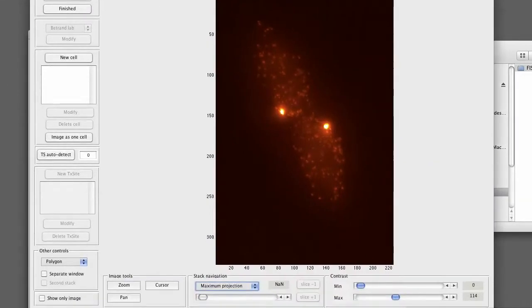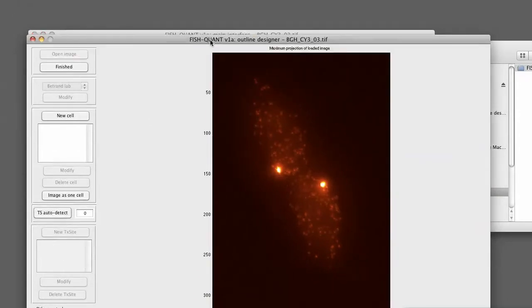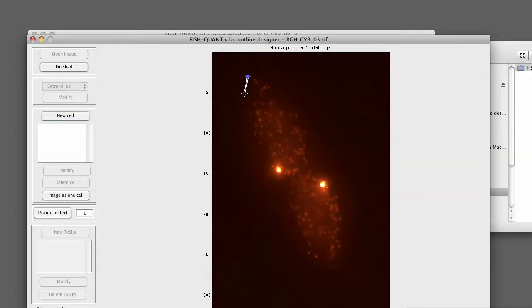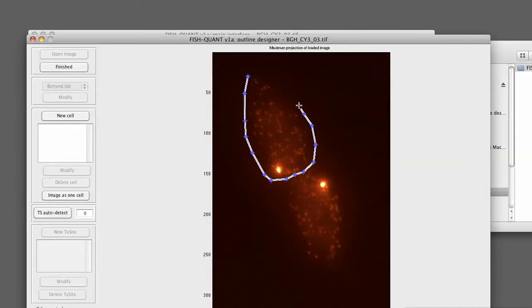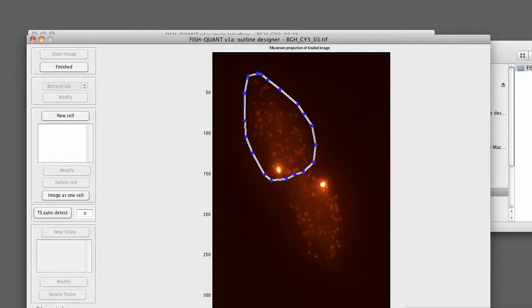As a geometry, we set the polygon. We press new cell. The cursor will then transform into a cross. Depending on your computer, this might take a little while. So just wait for a few seconds. We move over the image. You see it's a cross. We define the outline by simply pressing to define the knots of the polygon. As soon as we are done, we go back to the first point. The cross transforms to a circle and we double click. The outline will turn into a green solid line and we see that cell 1 was added to the list.